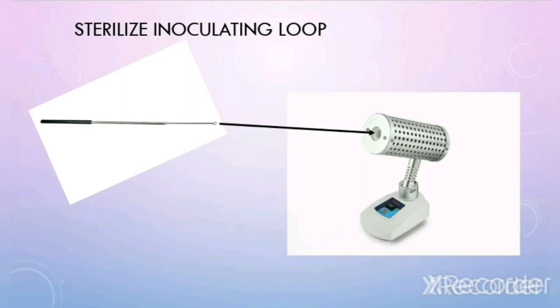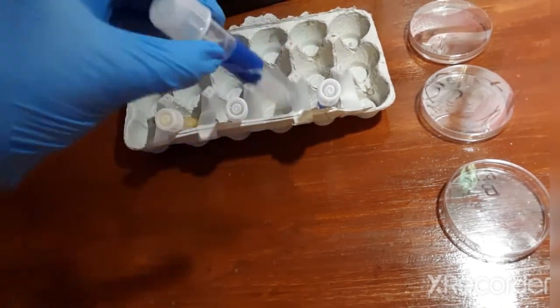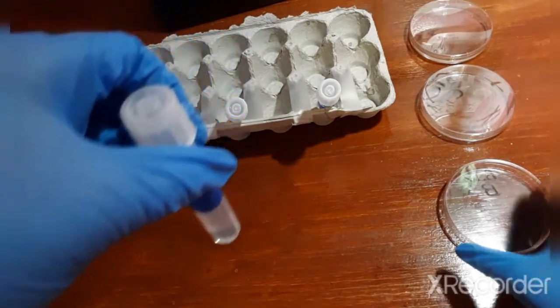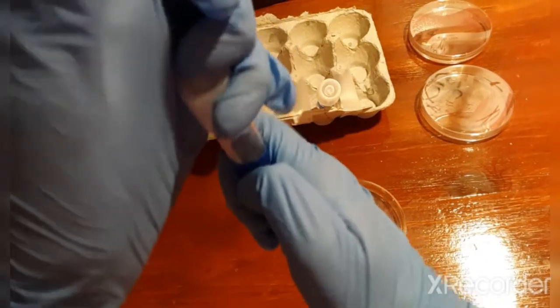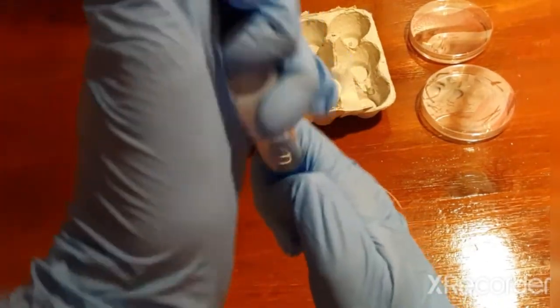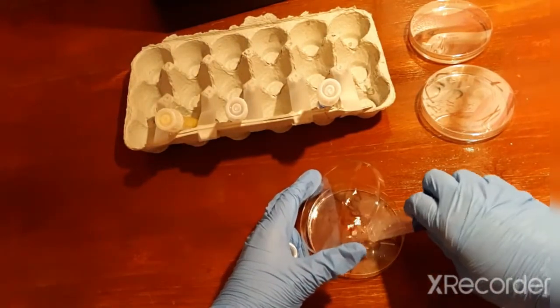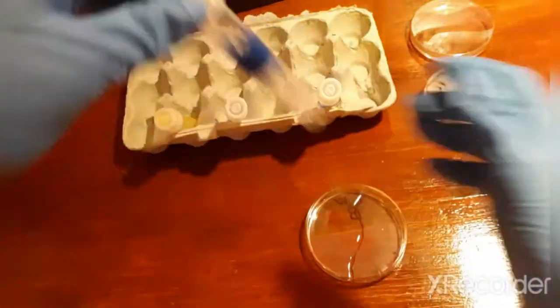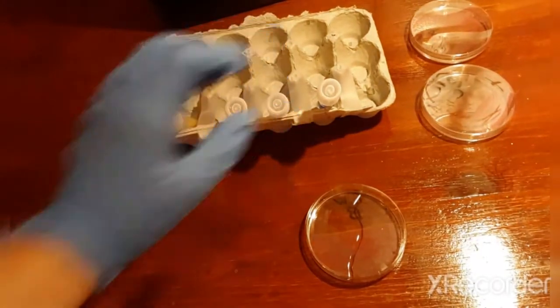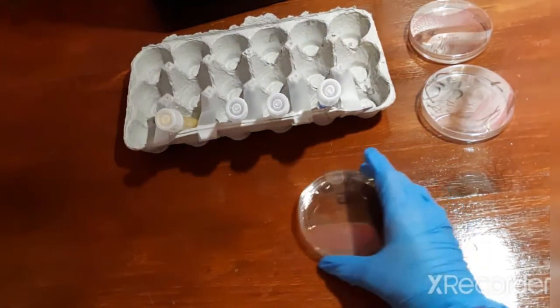Incinerate your loop one last time and set it back down on the bench top. Now we're going to do the same thing we did for A — take test tube B and pour its contents into the petri dish labeled B. Take the cap off, use the clamshell method to open the lid, and pour the contents of B into the petri dish. Put the cap back on, put it back in the test tube rack, and gently swirl the agar until the entire bottom of the plate is covered.